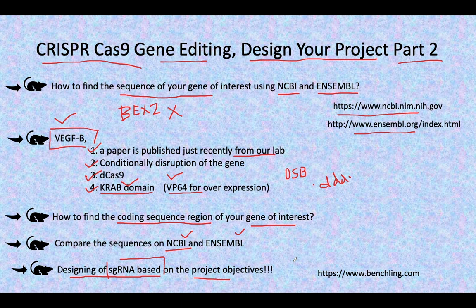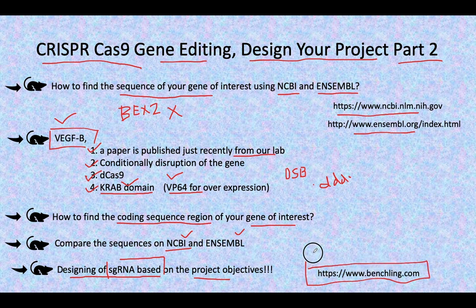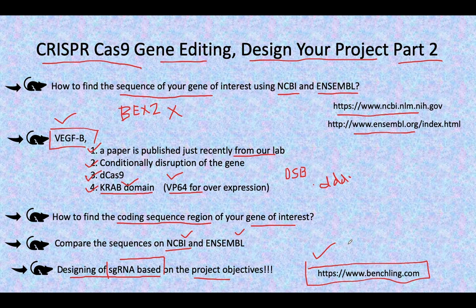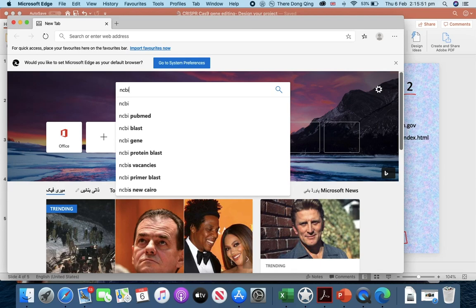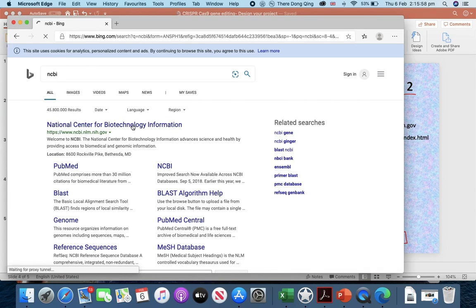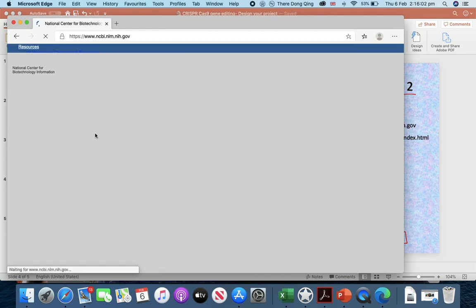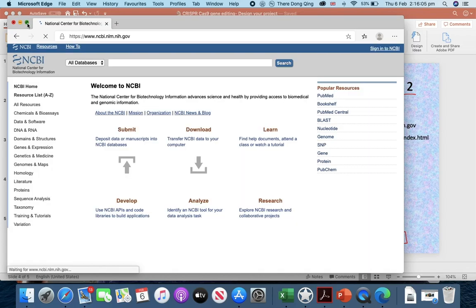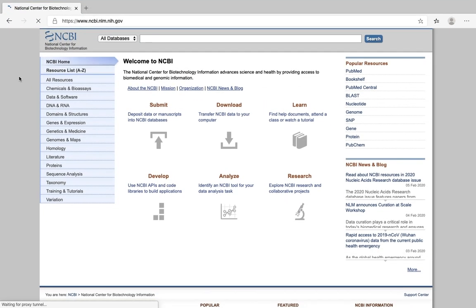There are many databases available for the design of sgRNA, but we will follow Benchling. Benchling is better because of many factors, and you will get to know these factors while we are designing the sgRNA. Now let's move towards the NCBI website - how one can find the gene sequence of interest. I will type here NCBI - National Center for Biotechnology Information. I have provided its website in the previous video as well.